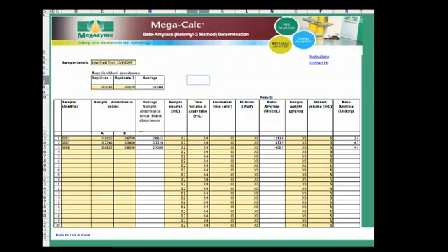In using the calculation device, the first thing is to enter the sample details. Then the absorbance values for the reaction blanks are entered as shown. Next, the sample identifier for the individual samples being analyzed is included, followed by the absorbance values in duplicate for each of those samples. The calculation device automatically takes an average.